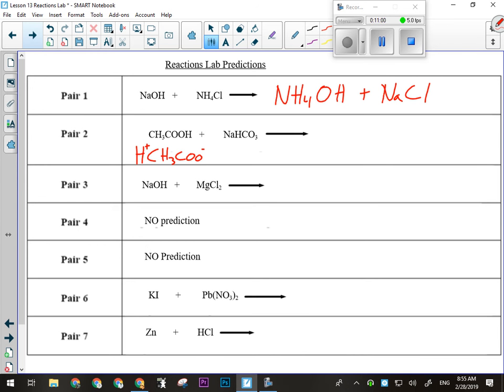All right, now this is not your store-bought vinegar. This is glacial, practically glacial, acetic acid. I took it out of our main glacial sample, which means absolutely 100% pure acetic acid, and I diluted it slightly because I like my samples to be uber concentrated, because then reactions are obvious. So this stuff is super concentrated. It will eat a hole in you. So be careful with it.